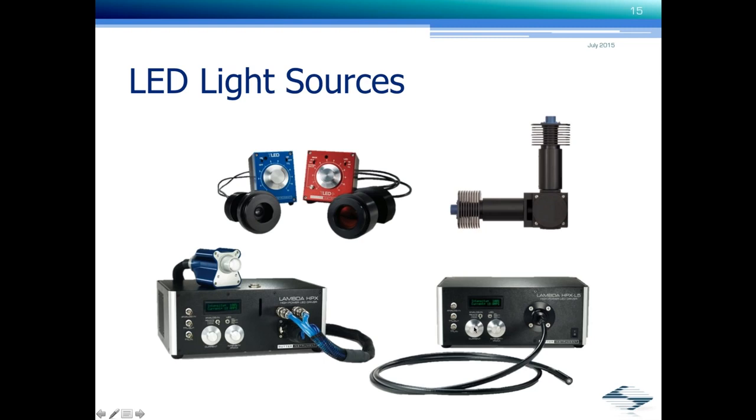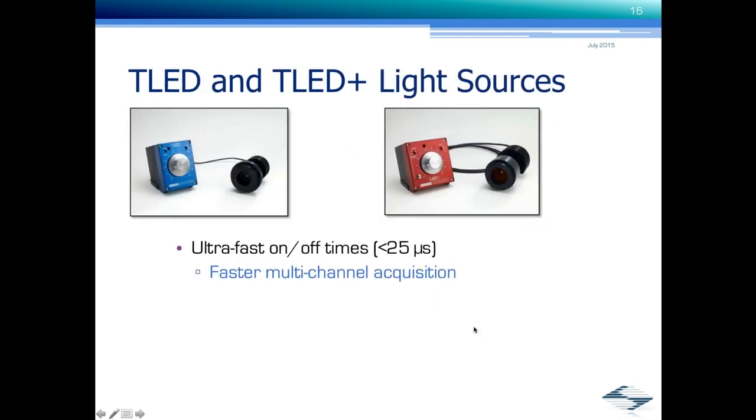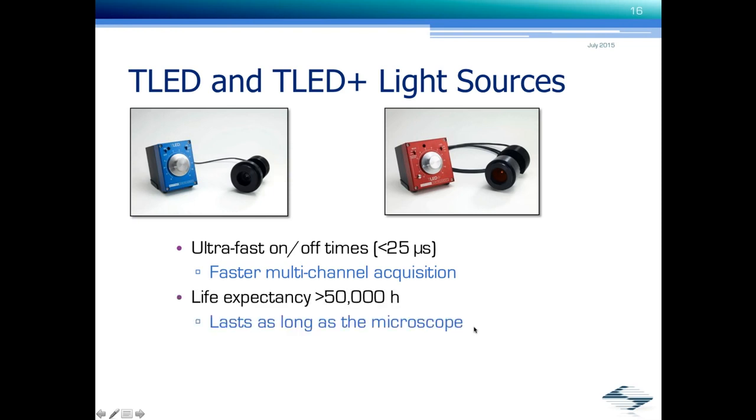Another new product, we found that amazingly many people do not know that we also have LED light sources and have had them for quite a few years. Started with the TLED and TLED Plus light sources, and an LED light source obviously has faster on-off times than many other light sources. That makes for faster multi-channel acquisition. The life expectancy is in excess of 50,000 hours.